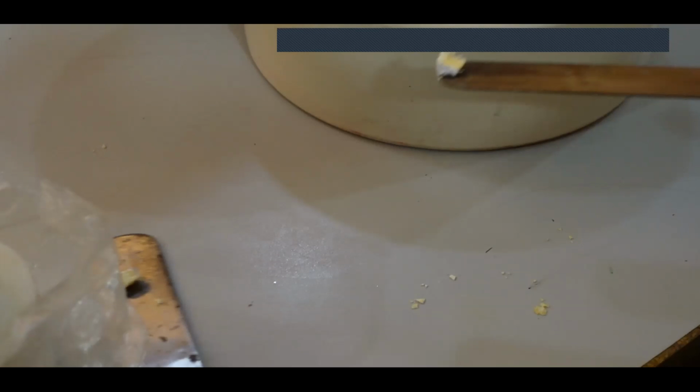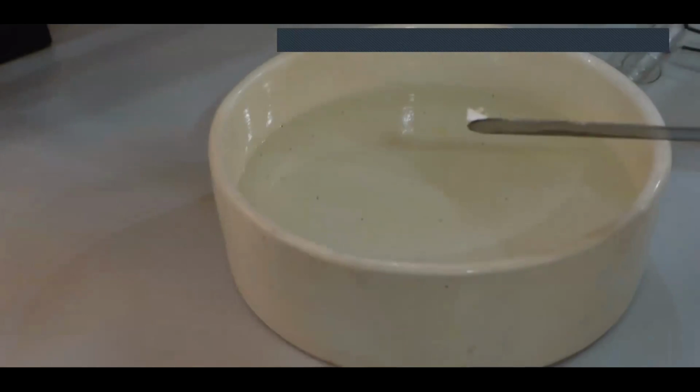That is how metals are. When they haven't reacted with air or when they're just fresh, they are shiny. And the fresh side that you have will quickly react with oxygen in the air. It will turn slightly grayish because it reacts with the oxygen in the air. And I'm adding it to water.